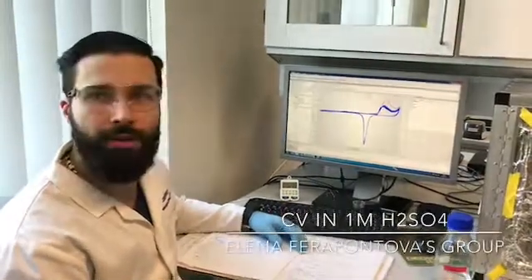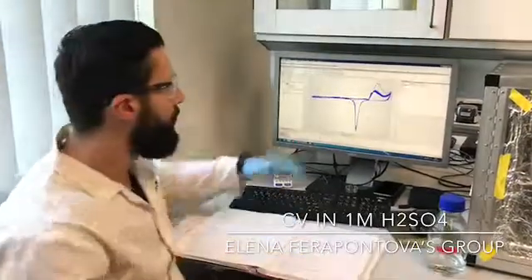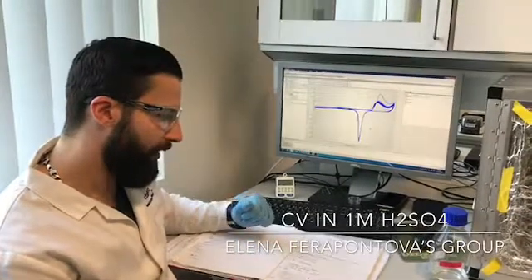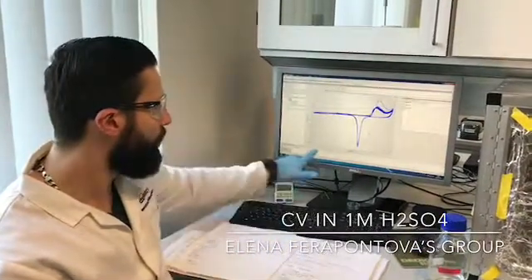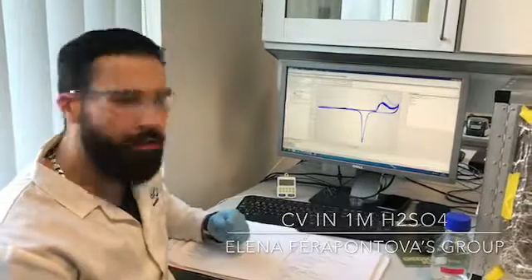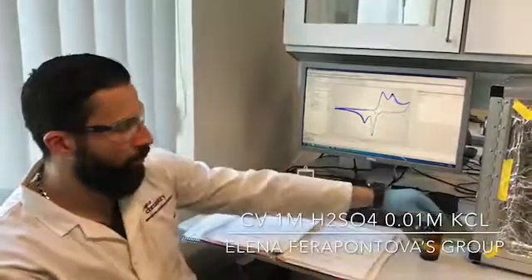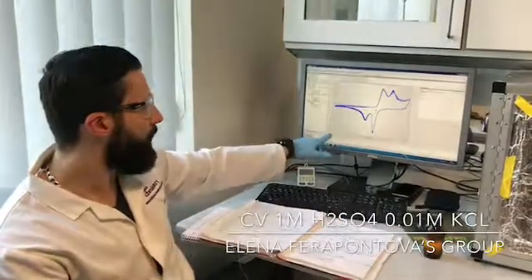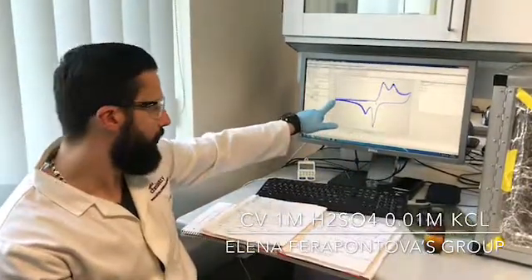When you are running the CVs in 1 molar sulfuric acid, this is what you should get. In this case, you are running 10 cycles from minus 0.3 volts all the way to 1.7 volts, and the scan rate is 300 millivolts per second. When you are running the CVs in 1 molar sulfuric acid with 10 millimolar potassium chloride, this is how it should look. In this case, you are running the CV from 0 to 1.7 volts, the scan rate is 300 millivolts per second, and you do this 10 times.